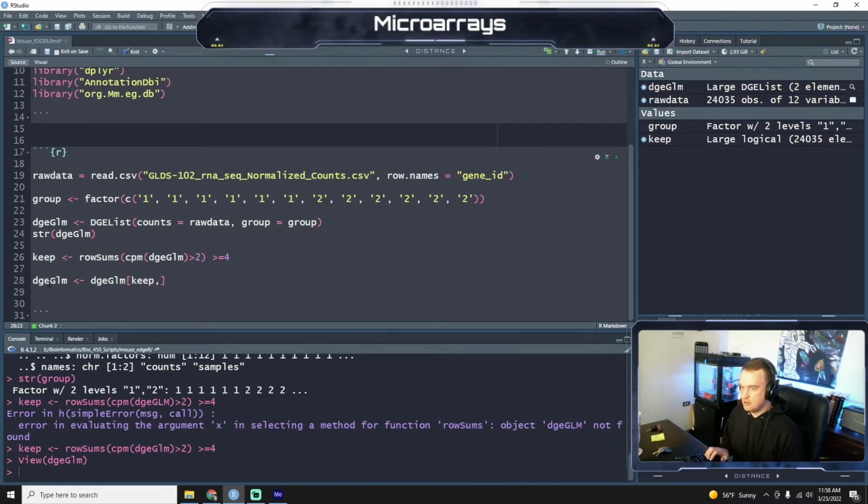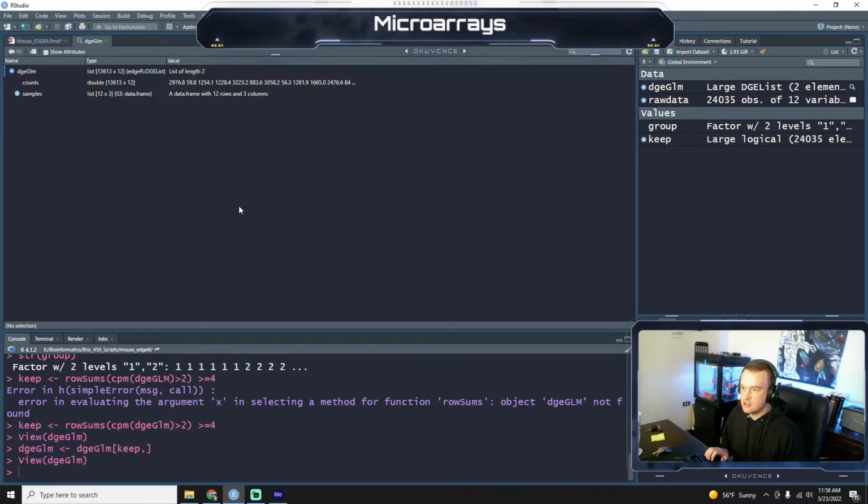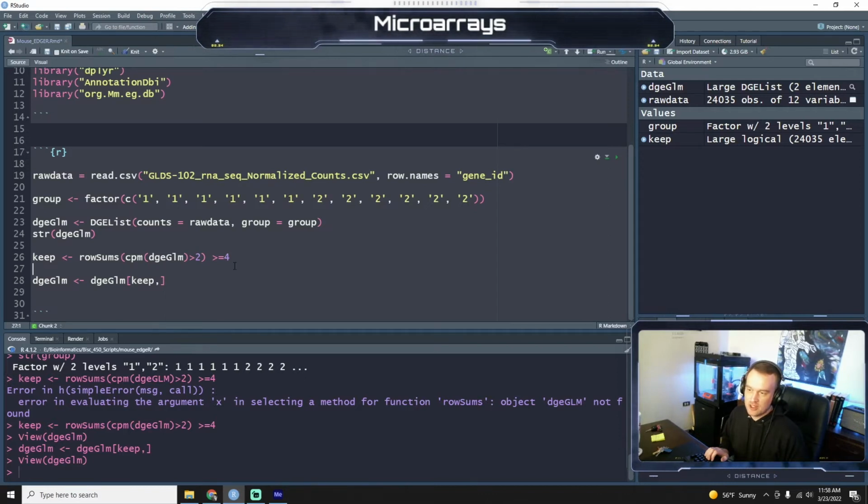Okay, here we go. So we did get rid of counts. And here we're just setting the variable of keep.